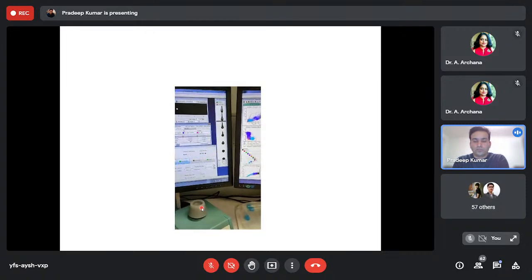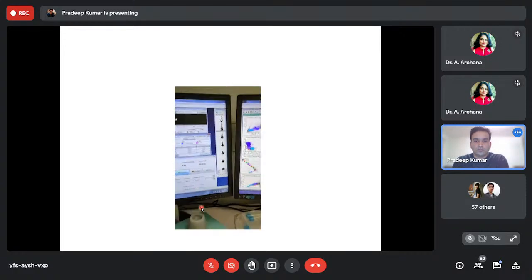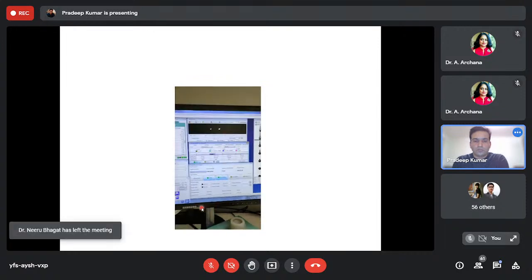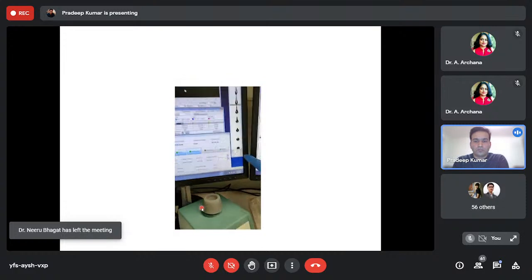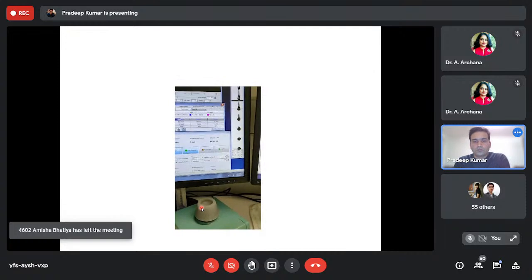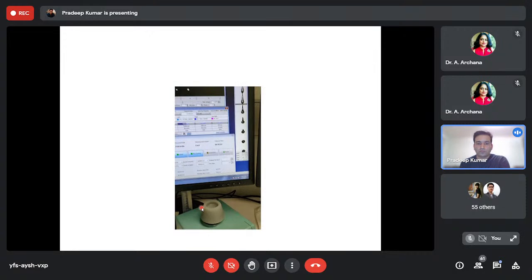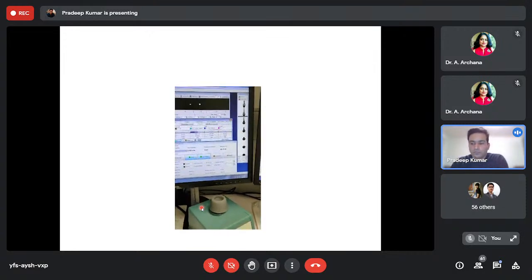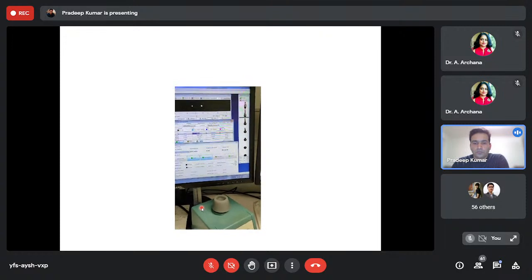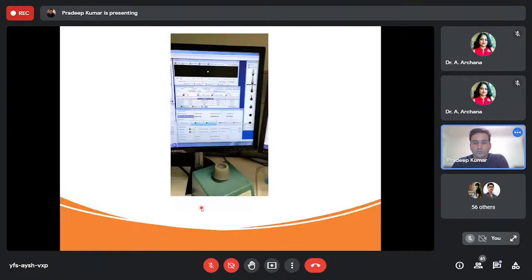That light scattering is collected by the detectors in the system, which are part of the optics. Forward scatter signal, side scatter signal, and fluorescent signals are all collected. And this continuous stream, with the help of a frequency in kilohertz, like 42.2, means 42,200 drops are forming per second. Maybe not all drops carry your cell of interest, maybe they do. We vibrate the stream, so at some point the continuous stream will break into droplets.